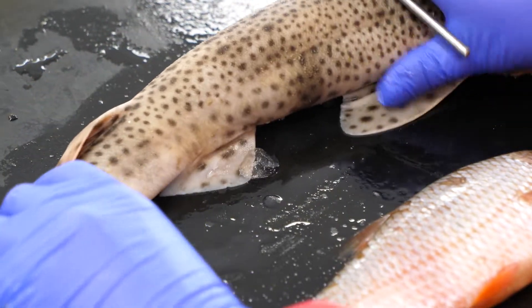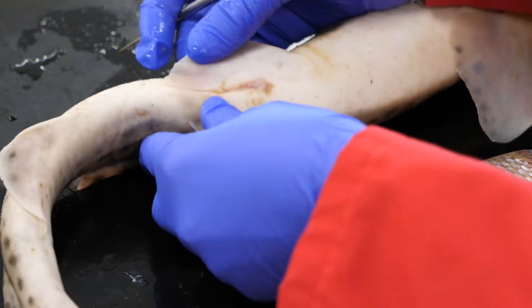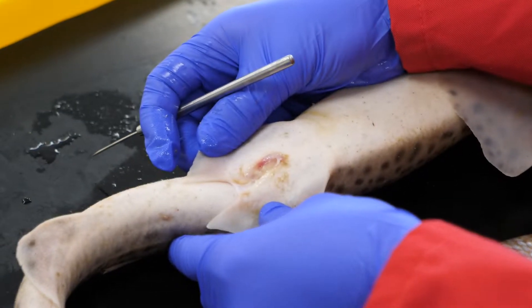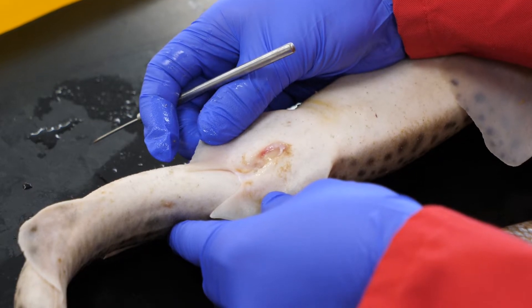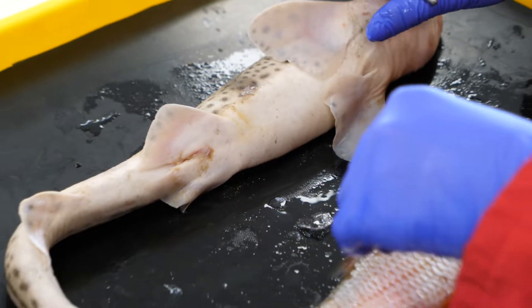Compare that to the shark — I'm going to turn it over here. We have a single opening. So this is called the cloaca, and this is for both waste and reproduction. And we'll have a look at that system when we go through the dissection on the inside.